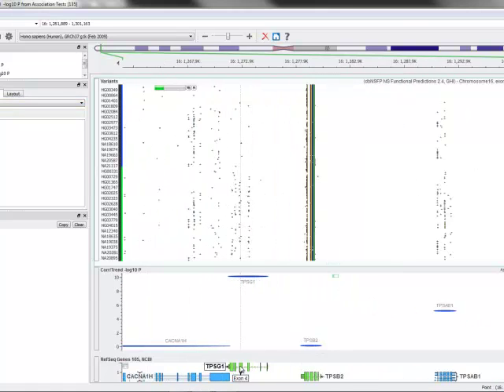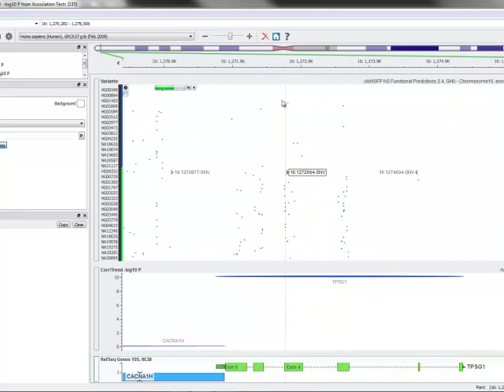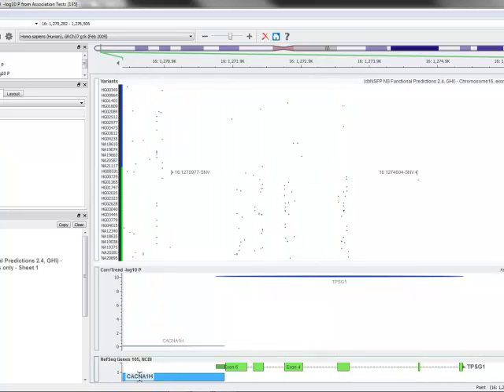If we look at TPS-G1, which was our strongest result, what you should see here now is that within this image, most of the variation is in the lower part of the plot. The samples have been sorted so that cases are at the bottom, so the case equals true variable is represented by green on the axis. So we can see that we have a lot more variation building up in cases than controls. This is exactly what we're looking for with this type of a burden test.